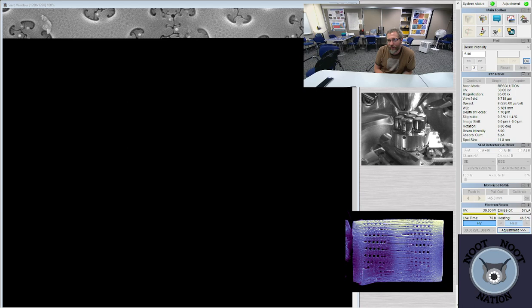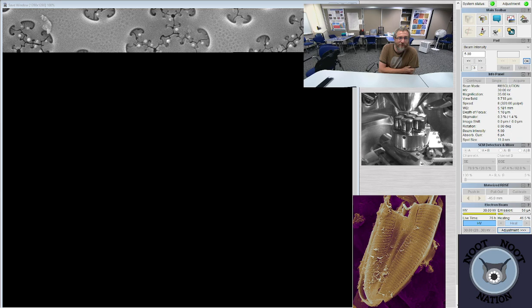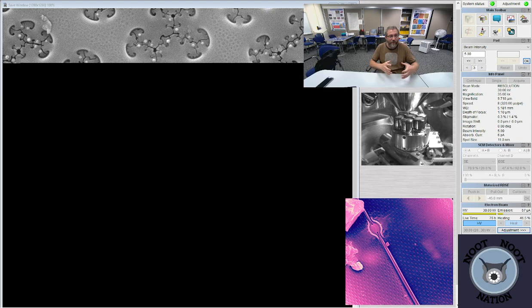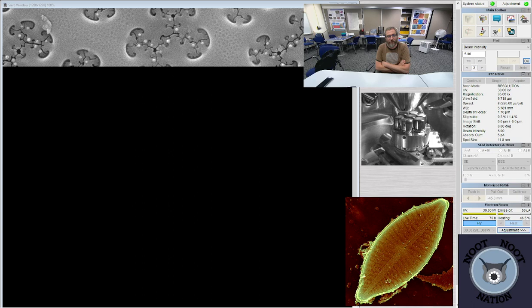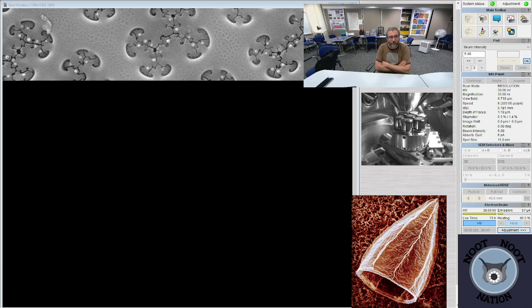Shield projector dish, yeah, exactly. It's a little bit like the famous enhance option that they show on TV series. You know, those are complete BS. Because if your camera can collect information at a high resolution, why would you collect it at a low resolution and then turn it up to high? You know, they do have some pretty cool programs like Topaz, which will take stuff that's kind of fuzzy and then figure out where it thinks lines should be. It uses artificial intelligence to try to figure out the actual structures of things, and then it will literally enhance the photo and sharpen it at the same time. I don't use that software, but I was thinking about buying it one of these days. My sister sort of raves about it. She just takes pictures at relatively high ISO and then runs it through that to clean up the images, but that's as close as we get to actual enhance.